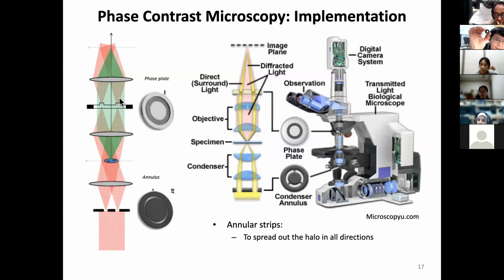Yeah, that is giving a 90-degree retardation at the back focal plane, which is conjugate to this pH1 ring. So with this, you can have an excellent imaging of this. The trick is that the phase contrast microscope does not require any more complex things.